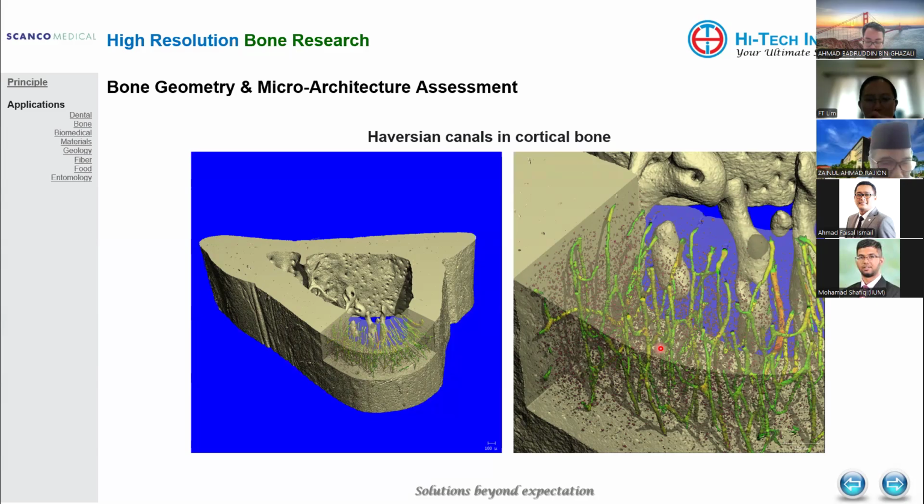That is basically secondary. It's more on in vivo or animal studies, where we can section that area, do teeth sectioning, scan the teeth, and see if there are any new tissues generated based on your micro CT data.